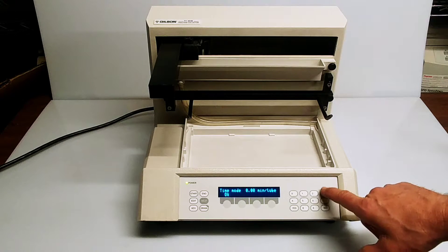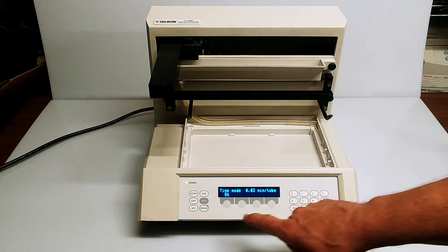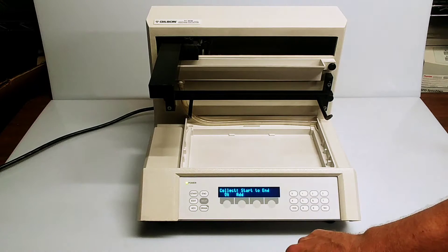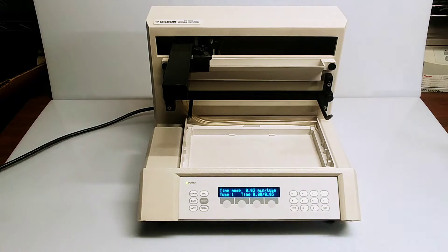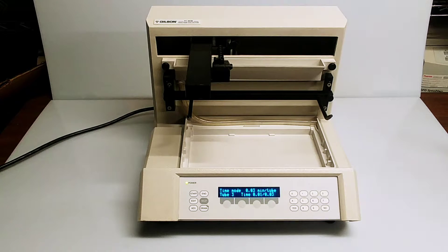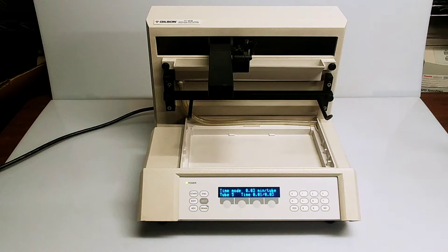We'll bring the time down to three seconds per, then say okay and start a run. You'll see it just increment through as though it's filling vials based on a three second collection period, and it'll run through all of the positions.